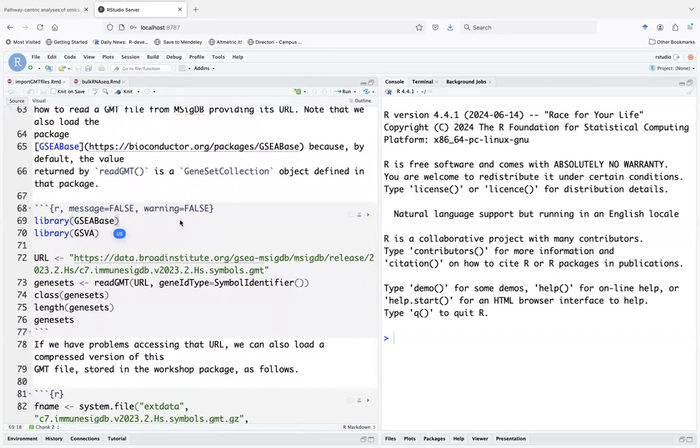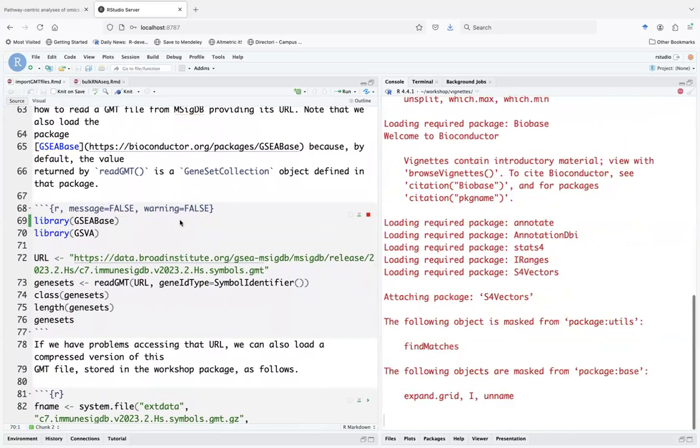Probably. Apple, enter for one line. For one line, Apple, enter. Perfect.